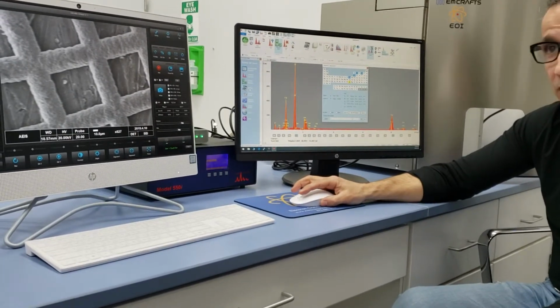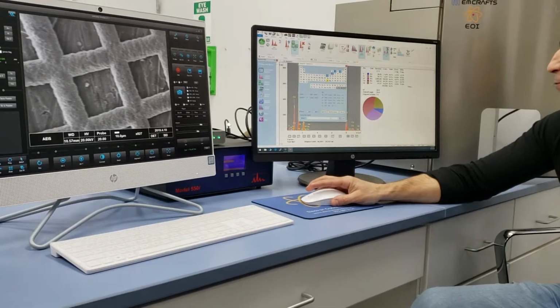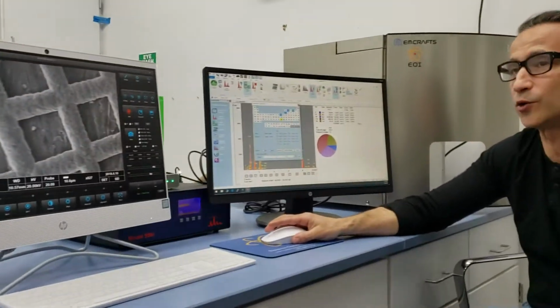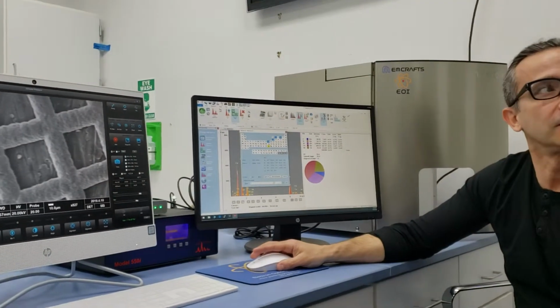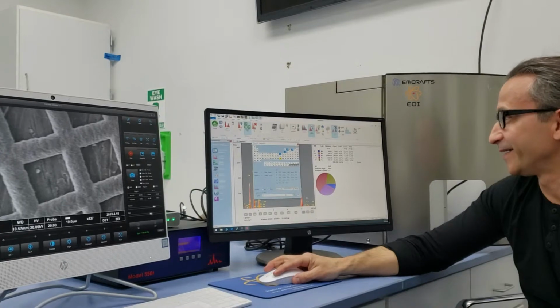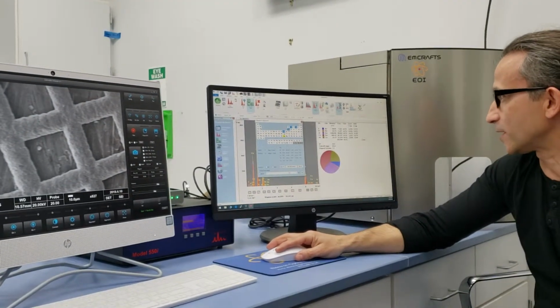We're still working on labeling. Okay. But if you want to skip around a little bit, right? We have 40% copper, 28% aluminum, 1% oxygen, 7% carbon, 21% gold. Perfect. Cool. Let's go back now and talk about labeling. Sorry. That's okay. Couldn't resist that. It's okay. It's easy enough to do these things, right?